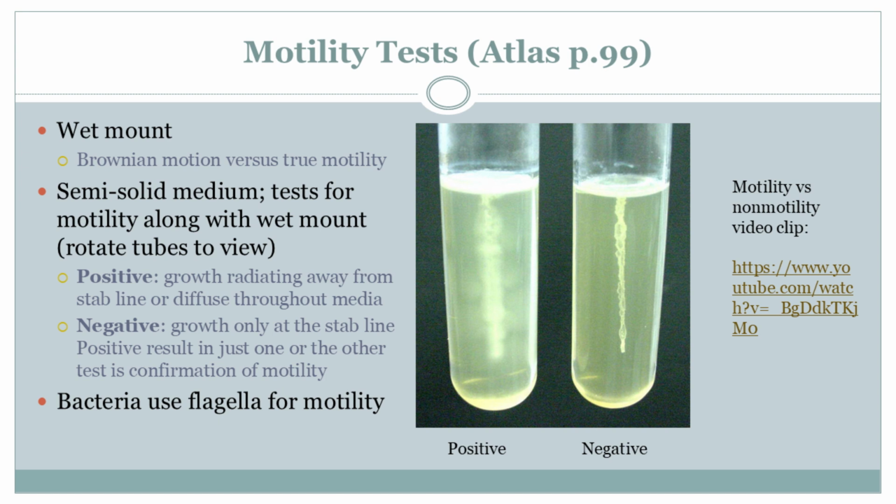Let's say you're looking at a bacterium that's super speedy, zooms around under the microscope. It'd be really hard to tell what it's doing in a wet mount. Yeah, like trying to track a fly in a hurricane. Exactly. And in that case, the semi-solid medium would be way more helpful. We give those little speed demons some time to move around, and then boom, we can easily see how far they've spread. So it's like, instead of trying to clock their speed, we're measuring their endurance.